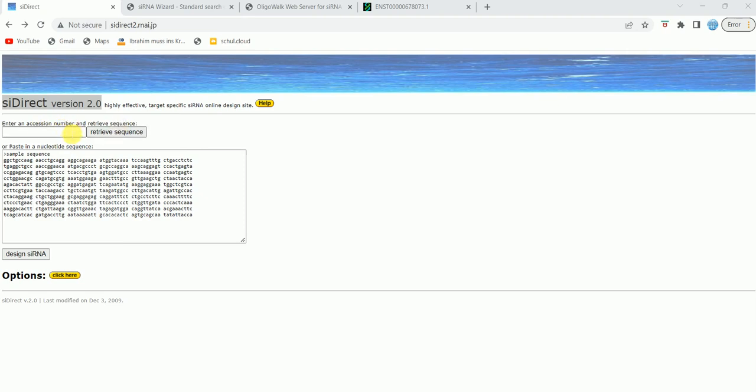For now I'm just going to keep this example sequence that's been given, and I'm going to keep this sequence as such. You can also retrieve the target sequence from by entering the accession number. Then after you paste your sequence, you can either directly click on design siRNA.